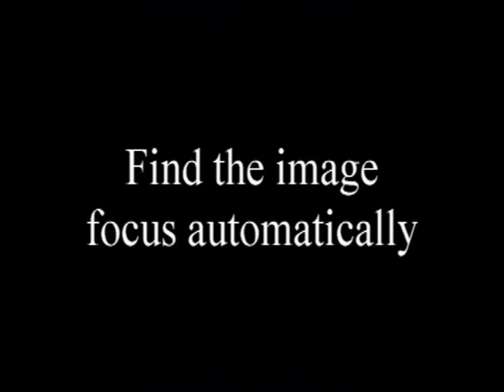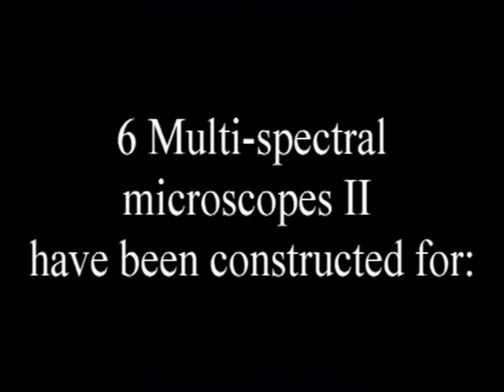Now we do not saturate. Once we have a good signal and we do not saturate, we try to find the focus. For that, we have a built-in function called find focus that you activate, and it moves the sample until we find the focus. And now we get it.